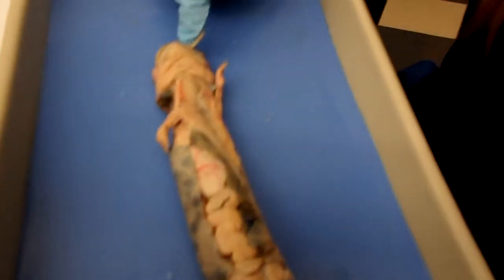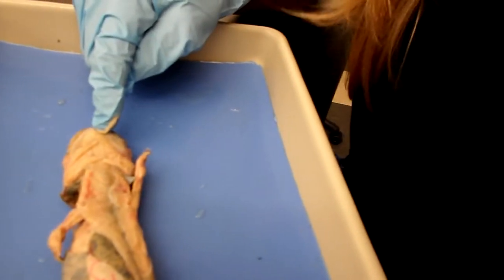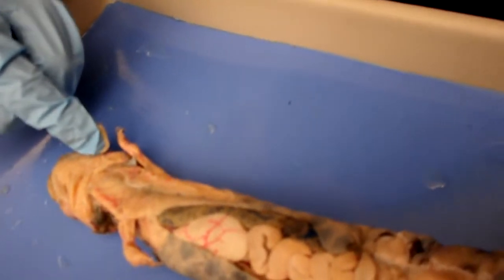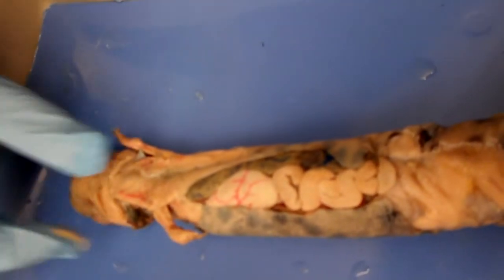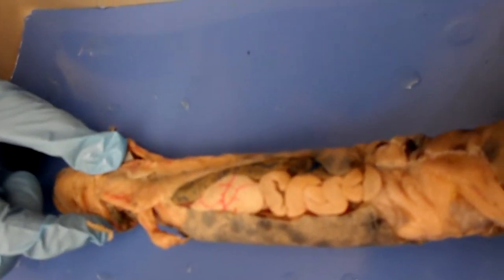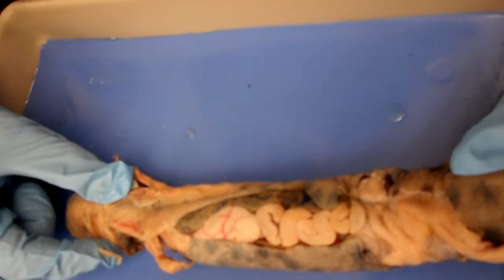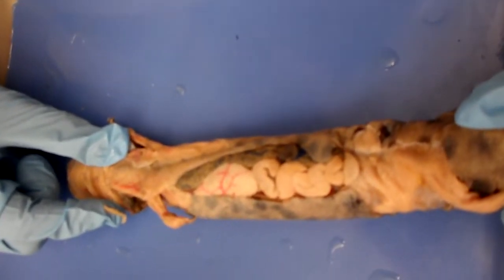This is the intermandibularis. It originates at the mandible and inserts at the median raphe. This is the interhyoideus. It originates at the fascia of depressor mandibulae and branchiohyoidus and inserts at the median raphe. And then this third section down here is the sphincter colli. It originates at the fascia of depressor mandibulae and branchiohyoidus and inserts at the median raphe.